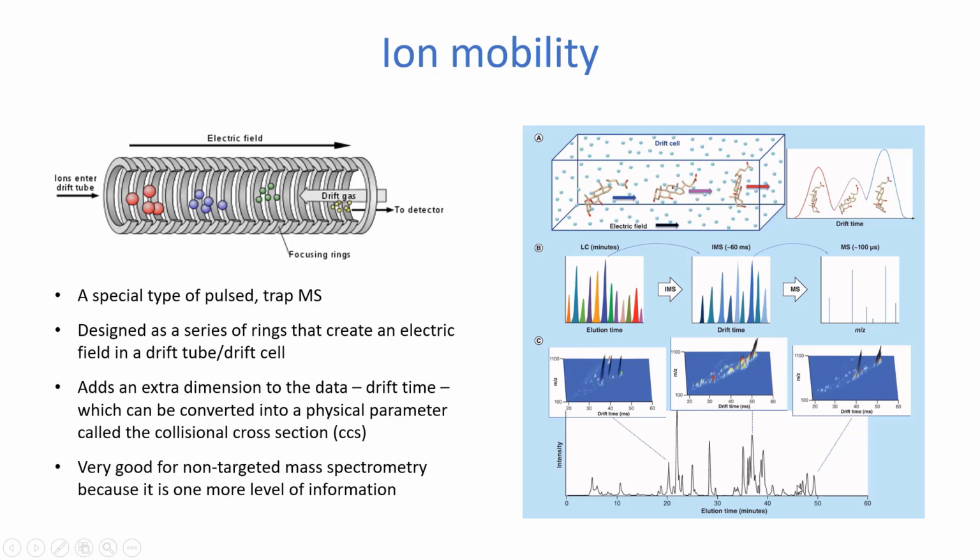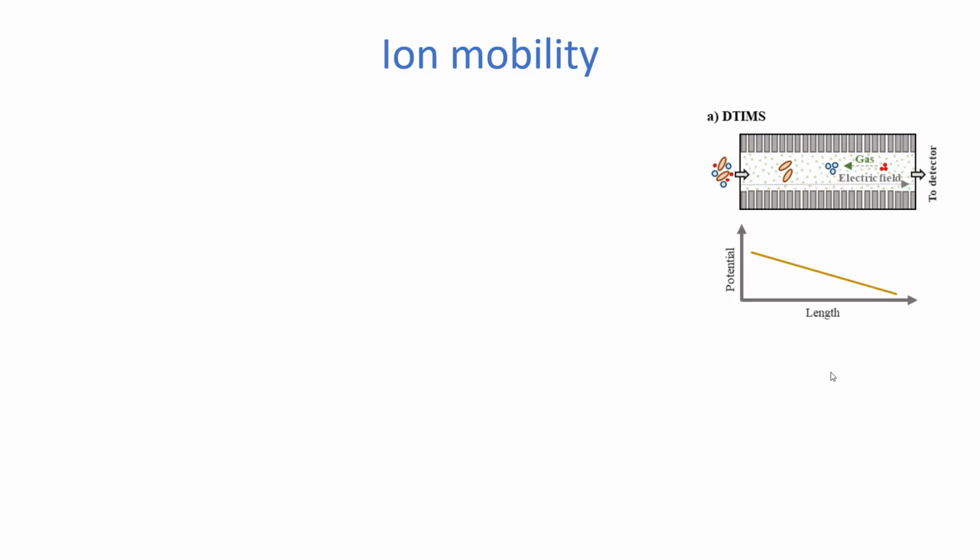I worked with one of these. It was really cool at the Ontario Ministry of Environment, Conservation and Parks when I was looking at contaminants in dust from e-waste facilities, and it was really fun, the number of charts and graphs you can make. At a certain point, it's pretty meaningless though. It just looks cool. But you can definitely resolve slightly different molecules, things that have the exact same formula, but maybe chlorine atoms on a slightly different part of a benzene ring, for instance, and it's really well resolved.